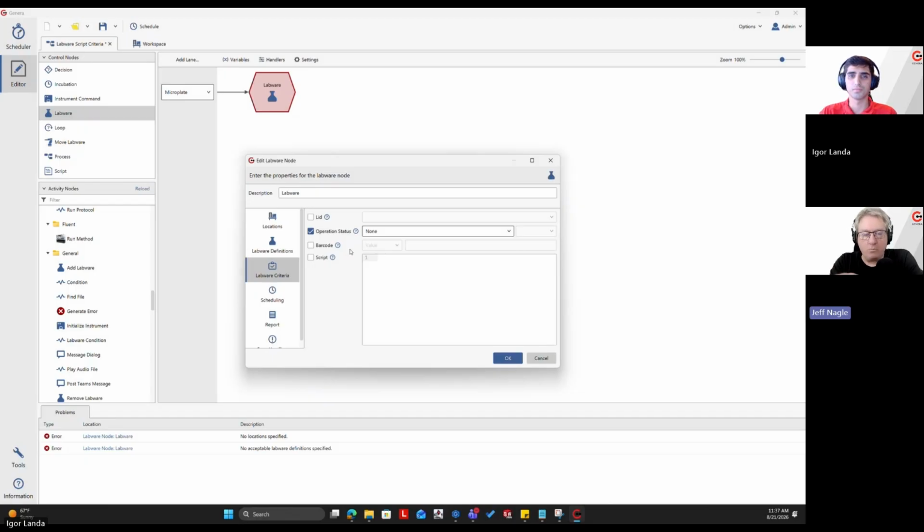I also think that you can use this in a sort of waterfall way. If you see the microplate lane that we're generating here, and maybe you have three or four others, once you get out of the microplate lane, you waterfall to the next one, which has a different criteria you're looking for that came out of the microplate lane, and then to the next one, and then to the next one. So you kind of waterfall down the process lanes. Yeah, this is very widely used.